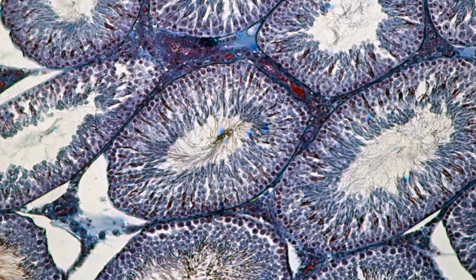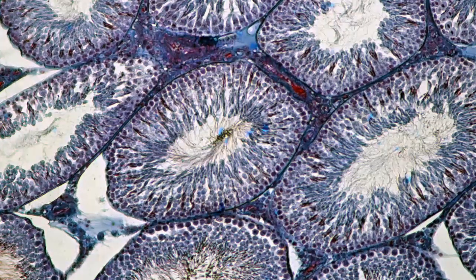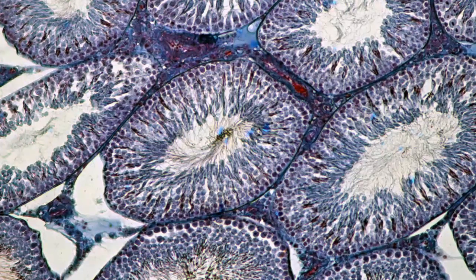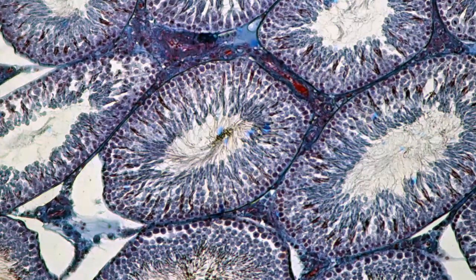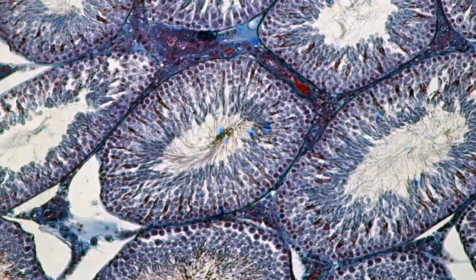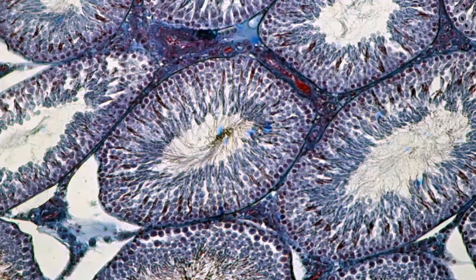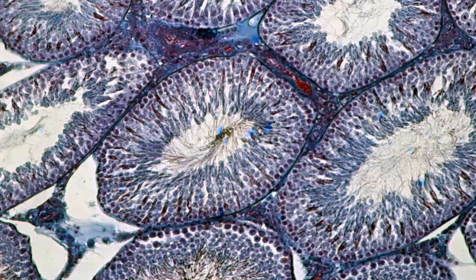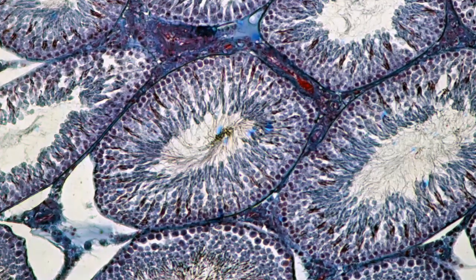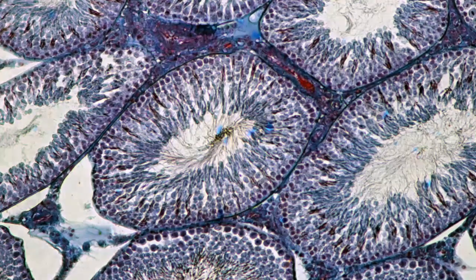Now we slowly start to see the tails of the sperm cells, and now we can also see the individual cells of the tubules. We can see also purple dark circles. Well, these are the individual cells. So there are thousands and thousands of cells that make up these tubules. I always think it's quite fascinating to see how complex and intricate everything is.